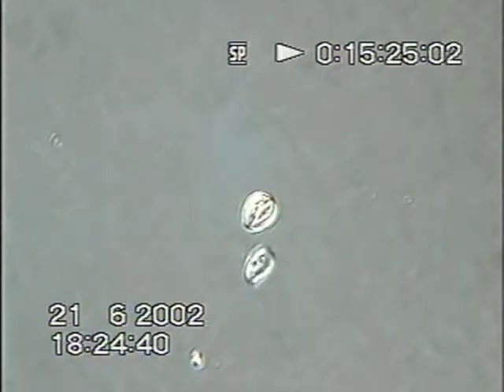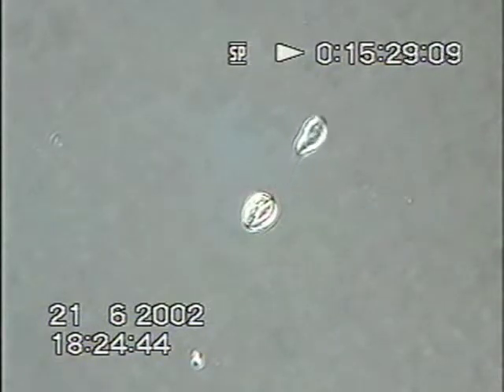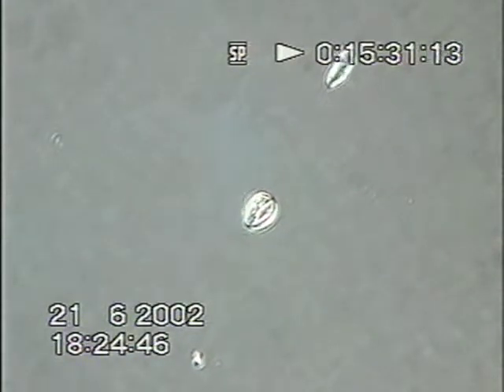Let's put the 20 on. If I can find them. There it is. Now, sure it's some kind of rotifer.